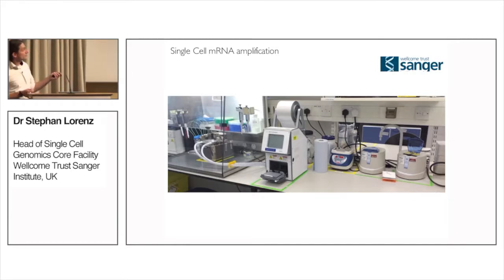We are going to replace this, also not with an Echo, sorry Devin, but a Bionex nanodrop. The whole workflow that we're then doing in the lab is dispense on the Mantis, seal, shake, spin, and then incubate for 3 to 5 hours, which is the main reason why we haven't gone for any integrated high throughput platform, because that's a massive bottleneck in the whole process. So this part of our process is manual processing. You can see the PCR hood with the Mantis, seal, shake, spin, and then tetrads are about here.